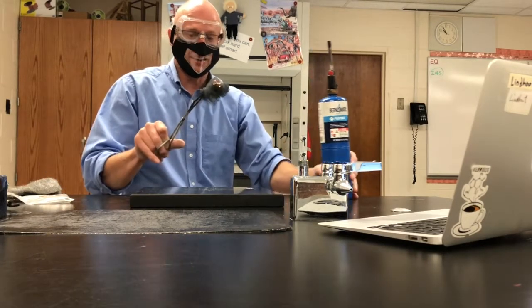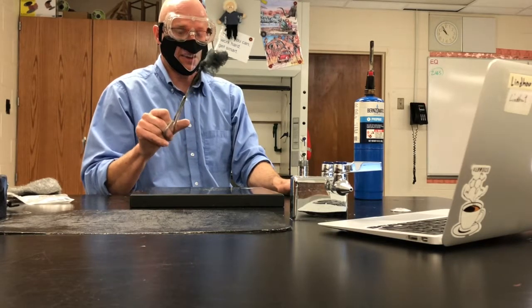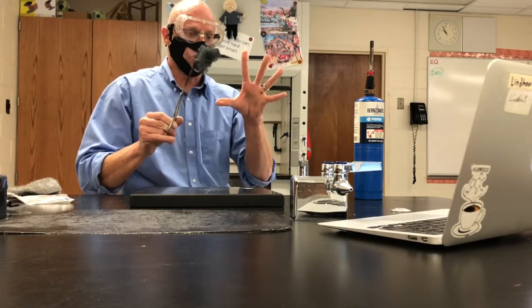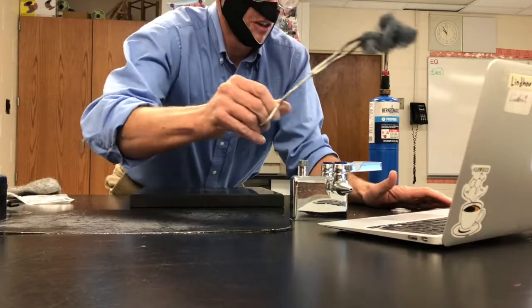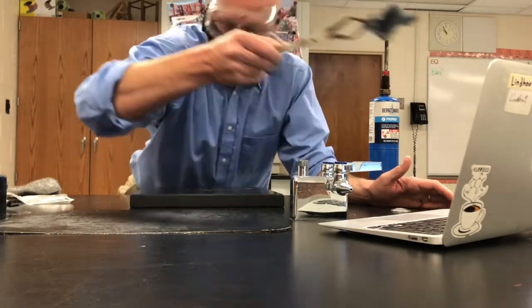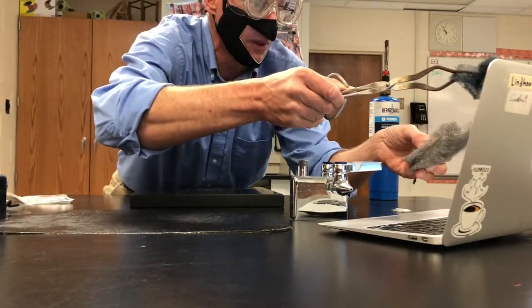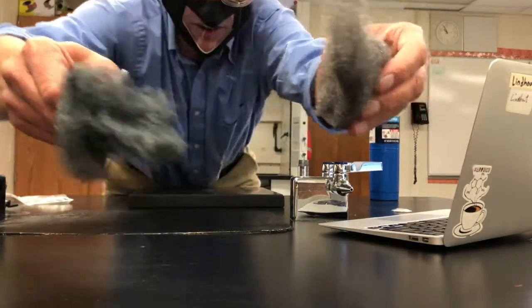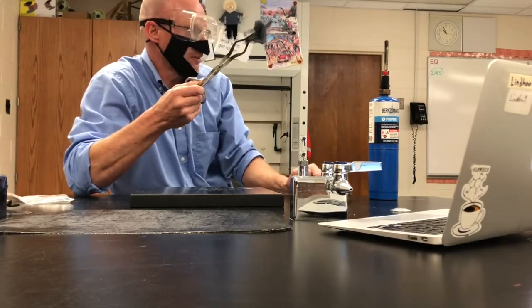Now, I don't know if you guys can see this, but the iron has actually changed, okay? The iron has changed. I've got two cameras going up here, so I'm gonna hold it up to each camera. If you guys see, the steel wool is not as shiny as it was before. It's kind of dull. There's a shiny piece of steel wool, and there's the piece that I just heated up. It's dull, and it's shiny. A chemical change has happened.